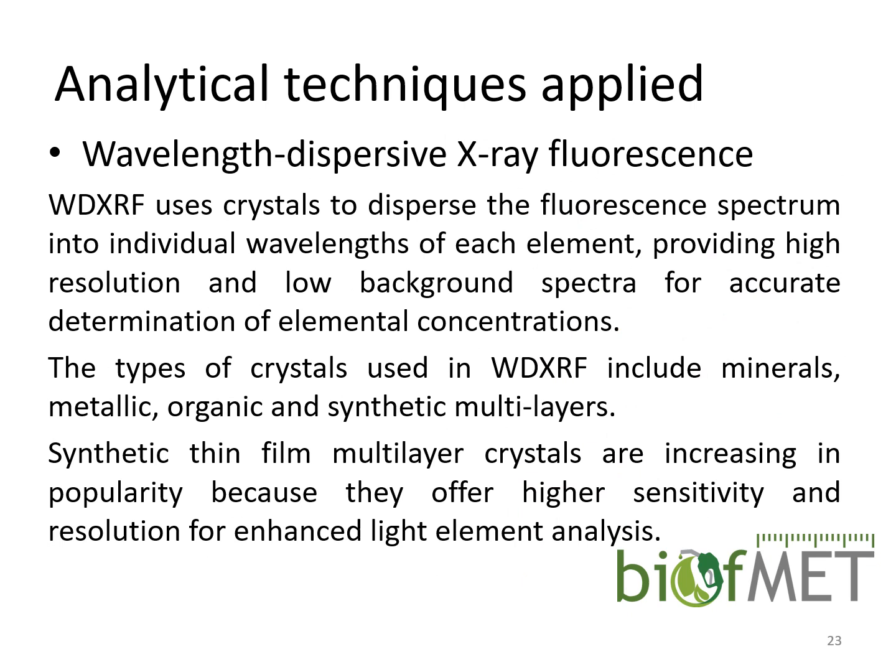Wavelength dispersive X-ray fluorescence is much more quantitative. It allows you to analyze lower concentrations. You can evade spectral interferences by applying certain crystals in order to filter out all unwanted radiation. So in that sense, this type of technique is much more recommended, but these instruments are usually bulkier, heavier, and placed in a laboratory.